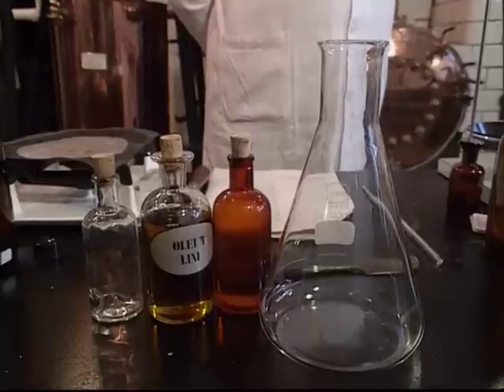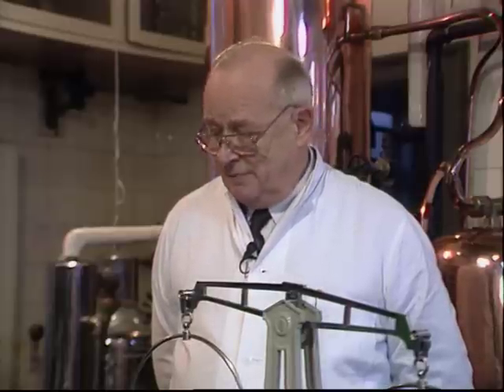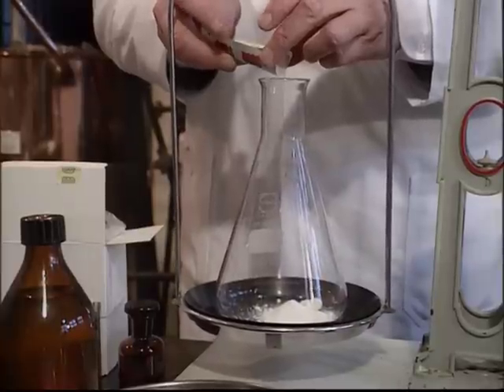Now we'll make a cream, which is an emulsion. And an emulsion normally is a substance comprised of two phases, an oil phase and a water phase, and the one phase is finely dispersed within the other. But we must also be sure about the emulsion's stability, so we add a third phase, an emulsifier, which ensures that it doesn't separate.